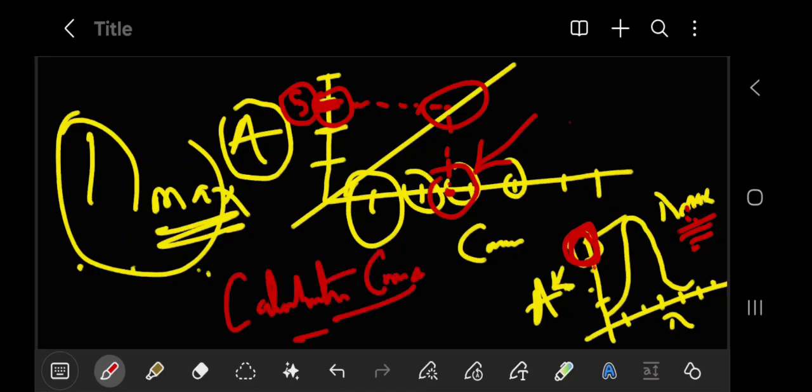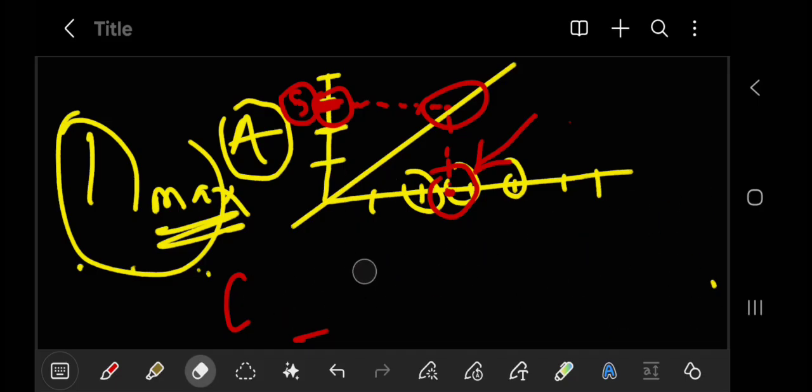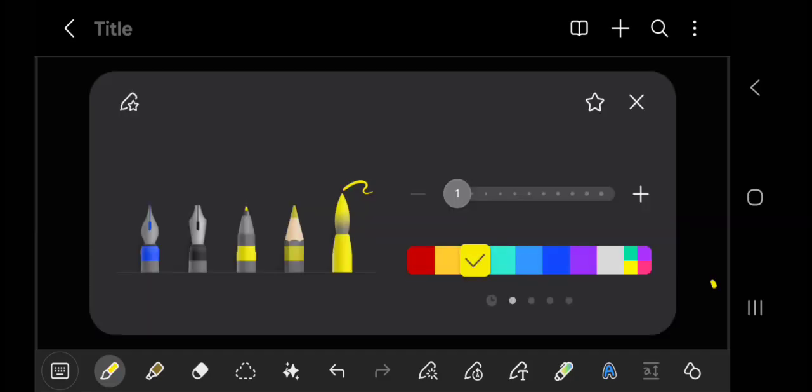All right, it's called the calibration curve, or you can call it the concentration curve, whichever suits you the best. Now, I saw somewhere in your manual that tells you how you're going to plot the graph, which I've already explained just now. You are asked to plot a graph of absorbance against wavelengths of the potassium chromate solution.